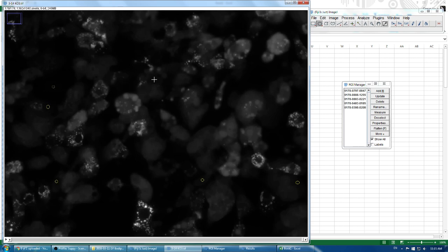Whatever you want. You could do a true blank as well on the background. I found that the cell blanks seem to provide slightly better results though. At least for our protocol. Provides significantly better results.